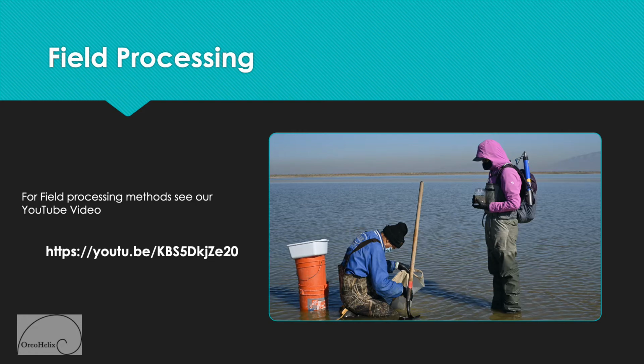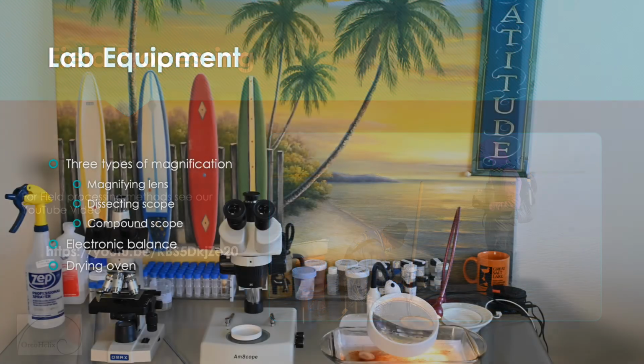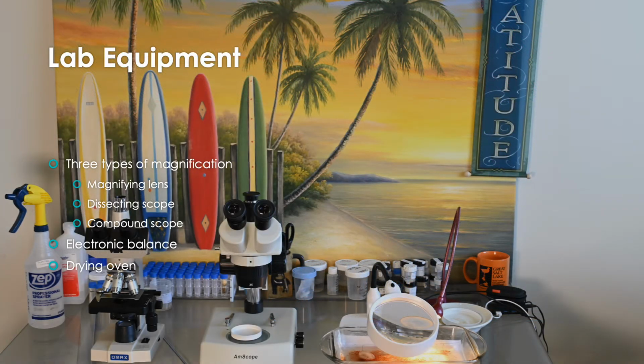For our field processing methods, see our YouTube video at this link. We used three types of magnification: an illuminated magnifying lens, a dissecting microscope, and a compound microscope. We used a drying oven and an electronic balance to weigh the dried macroinvertebrates.